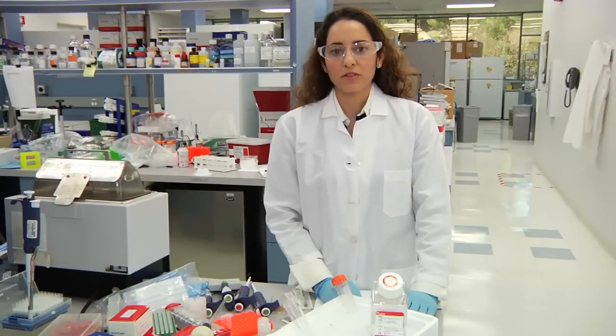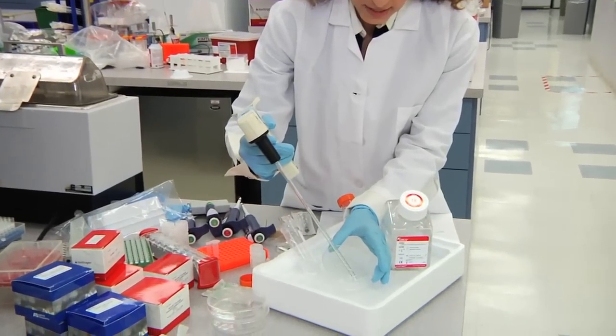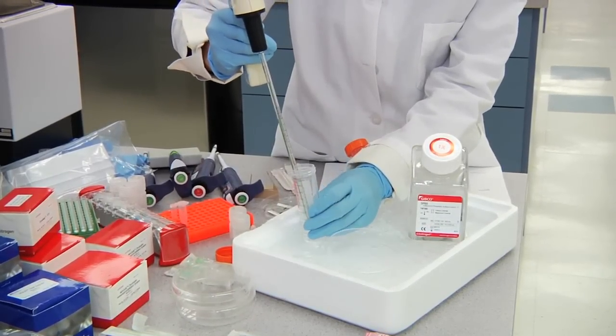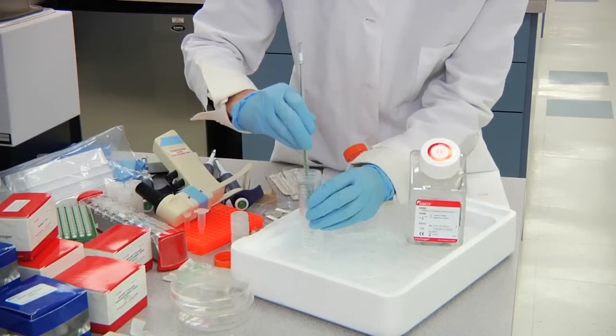Step three: we're going to transfer our tissue into a 50 mL conical tube and mash the tissue in order to proceed to homogenization. Take a 2 mL pipette and while the sample is still on ice, collect your sample that has been in the PBS and transfer it to an ice cold 50 mL conical tube. Use your pipette to mash the tissue as much as possible.